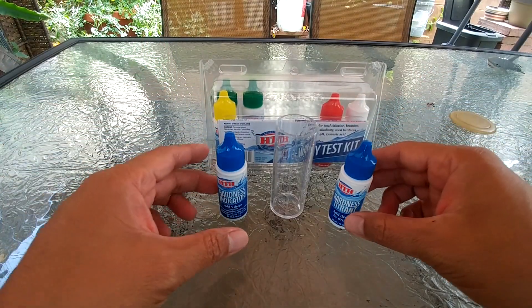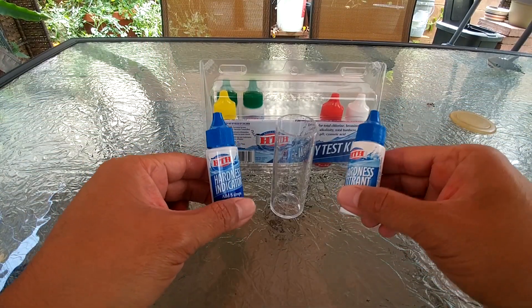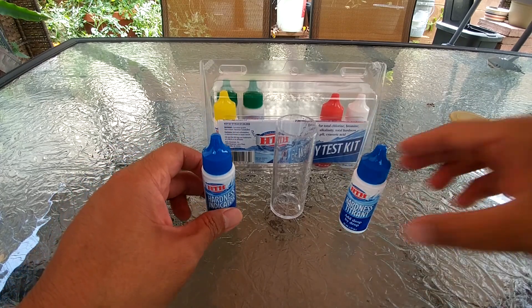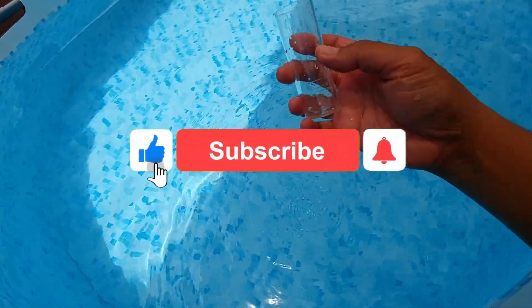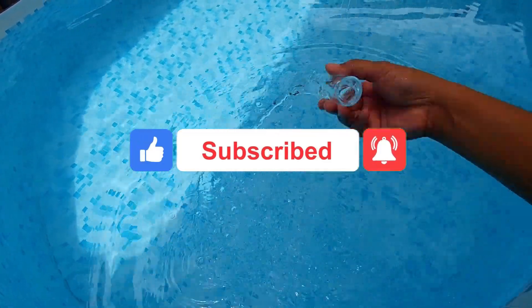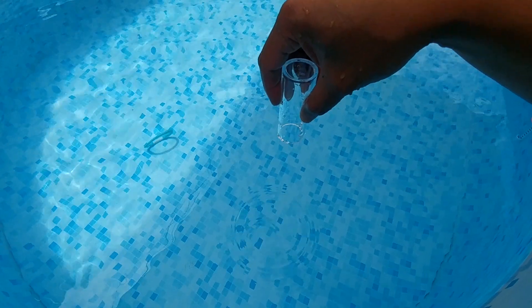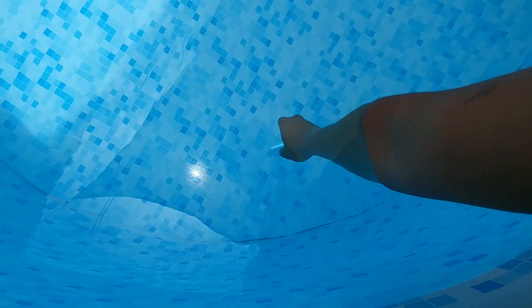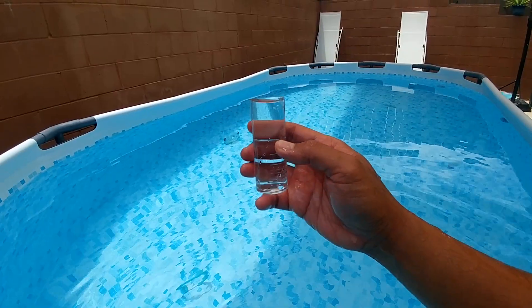For this video I'm going to show you how to test the total hardness in your pool water using the HTH six-way test kit. To test for hardness you want to fill this to 25 ml. What I do is I clean it first and then I put it under upside down so that it creates an air pocket at elbow length, and then you lift it back up.